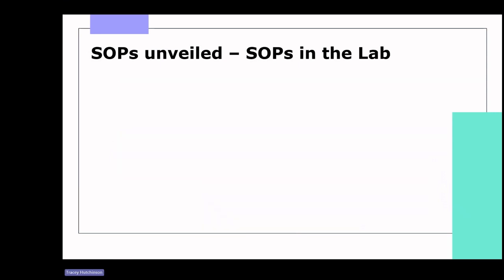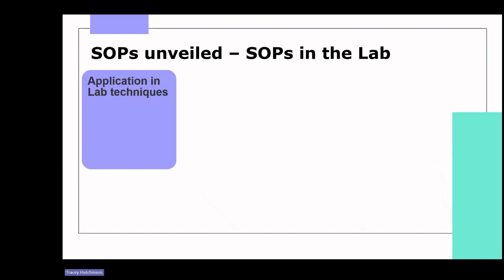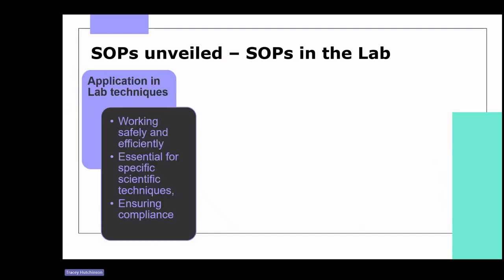SOPs aren't just documents, they guide us in working safely and efficiently in a laboratory. Following SOPs is essential when performing specific scientific techniques, ensuring compliance with regulations and maintaining quality standards.